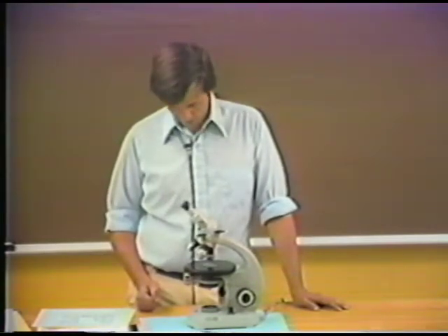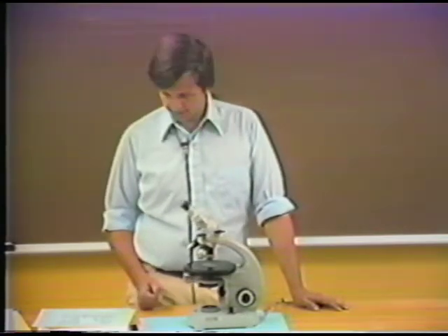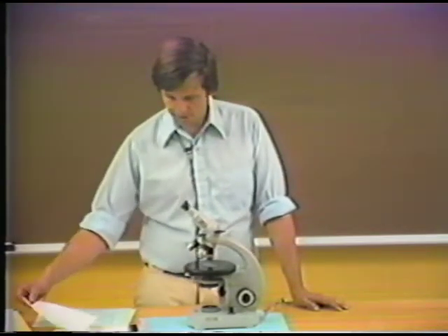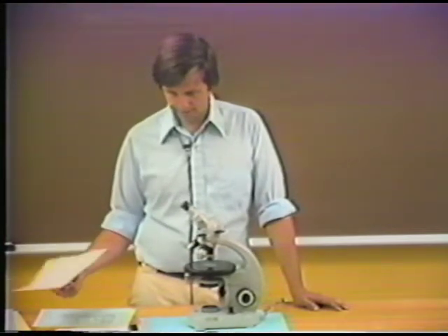If there is addition in the northeast quadrant, then the mineral has a positive optic sign. This is telling us then that the epsilon refractive index is greater than omega, and also that the E ray is the slow ray in this particular mineral. So quartz, being a positive optic uniaxial mineral, shows a positive sign in this kind of direction.